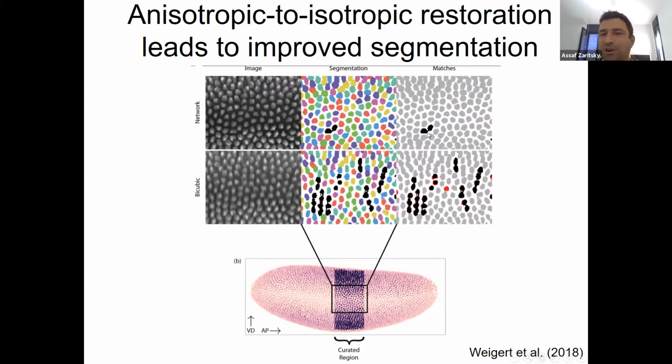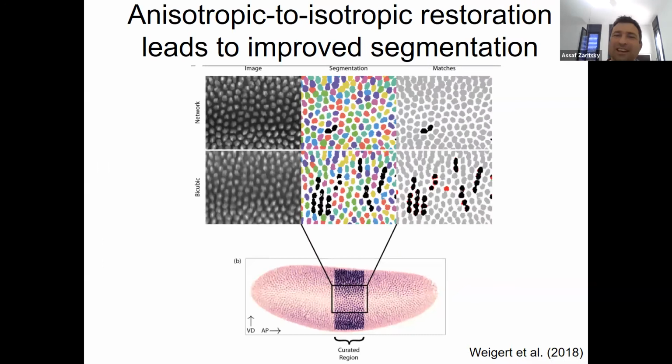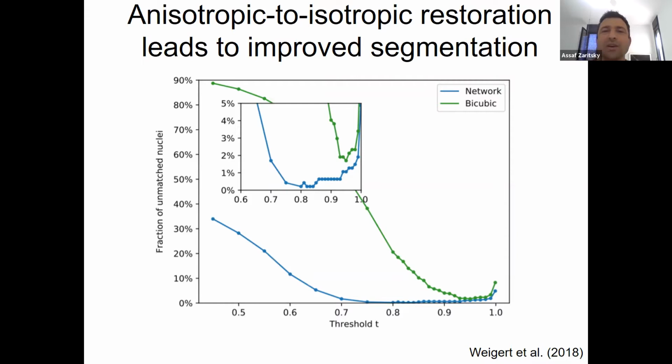And so we go from qualitative to quantitative, right? We start with images, then we go to post-processing, but we still look at just some examples, and eventually we can go and look at it systematically. So here the idea is to check the ability to track cells over time. Tracking cells is also, well, the rate limiting factor is the ability to match pairs of the same.